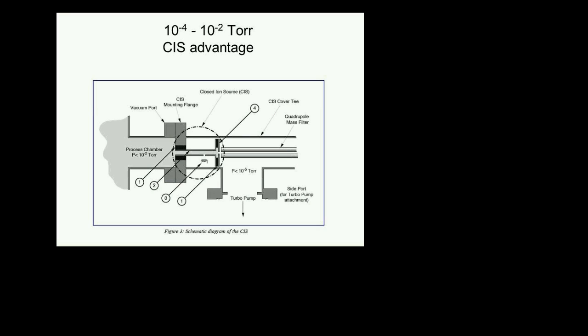And they're doing it for two reasons. One, because they can make more money at the closed ion source system. So, this is a sales guy, you can't blame him for it. But the other reason he's doing it is because it has a better detection limit for water. Okay? So if water level measurements down to a part per million are very important for you, definitely order the closed ion source version. But I will tell you right now, closed ion sources are higher maintenance devices.